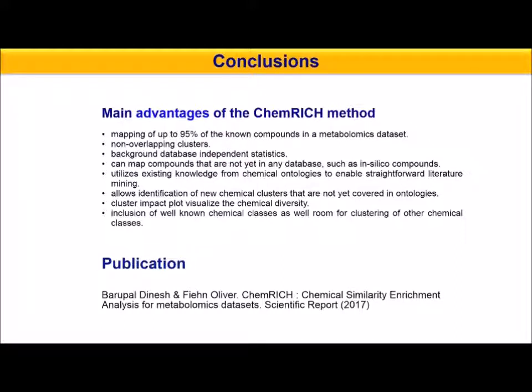It utilizes existing knowledge from chemical ontologies to enable straightforward literature mining. All the class label names by MeSH are extracted from PubMed. So if you search those names in the PubMed database, you already find the relevant publications.